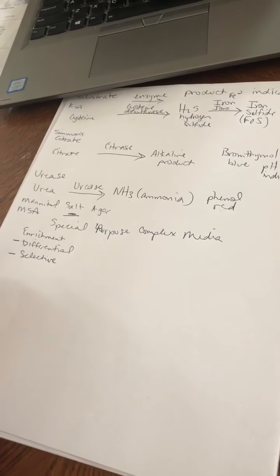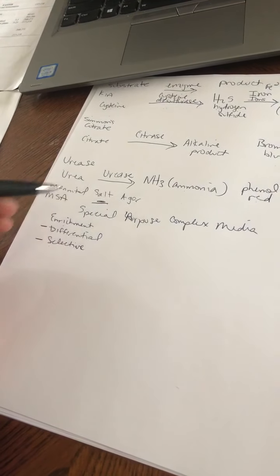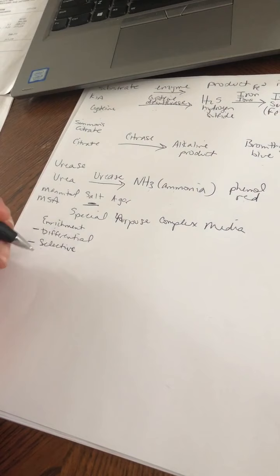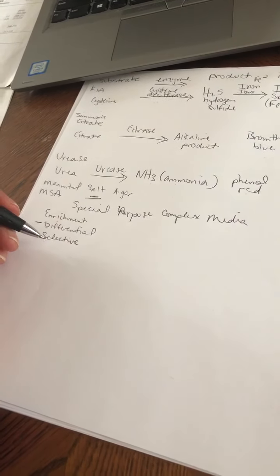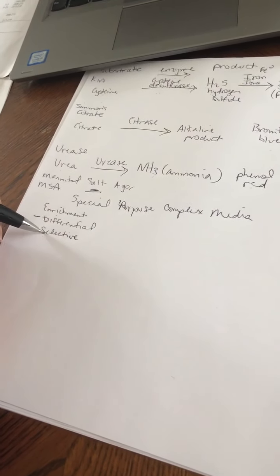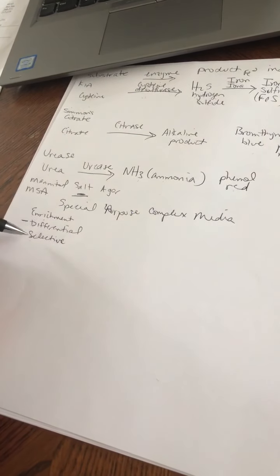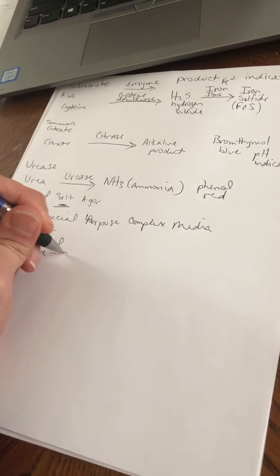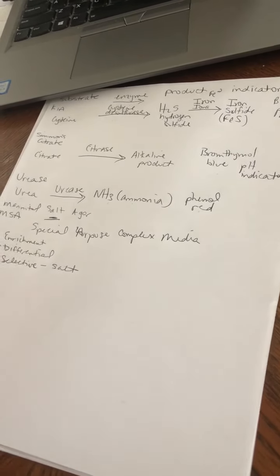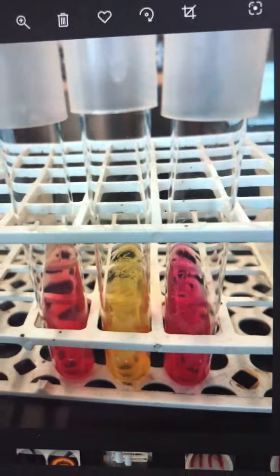So it's got mannitol, which we know is a sugar, and it's got salt. So that salt is what's called the selective ingredient. It can select out for bacteria that can or can't grow in high salt. It's got like 5% salt in there, and not a lot of bacteria can grow in a high salt environment. And then if they can grow in a high salt environment, it's differential based on the color it's going to change. So the selective ingredient is the salt. And then if it grows, we're going to look to see what color does it change. So then we would look to see, does it turn it yellow or does it turn it magenta?